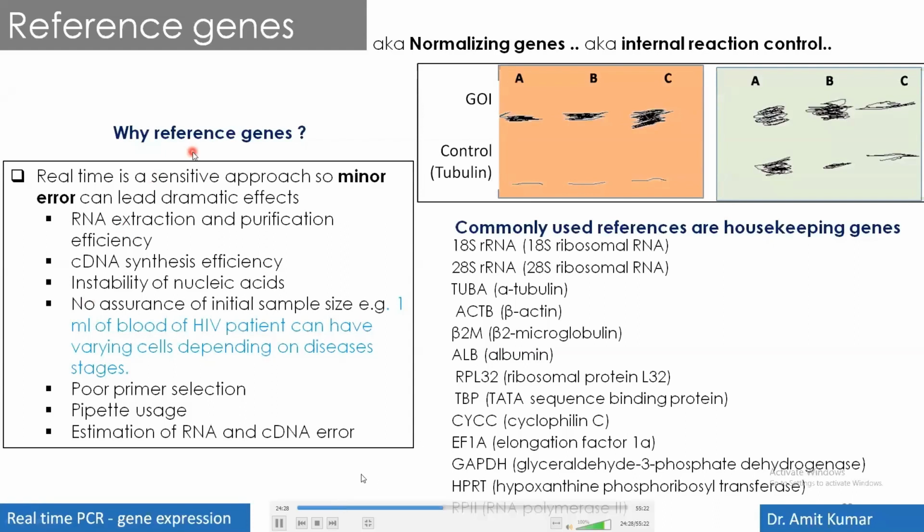So what does this reference gene mean? Reference gene means something which assures that there is no technical problem in your analysis, and whatever the differences in the expression are, that is due to the biological activity or the experiment we are performing.